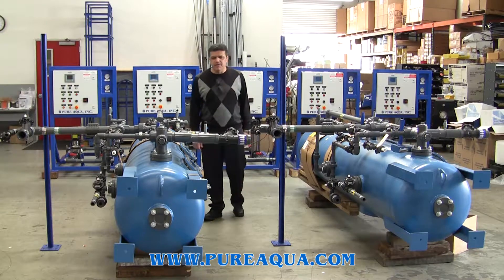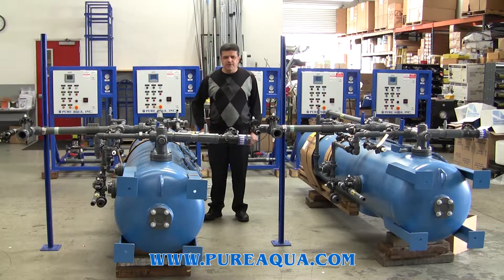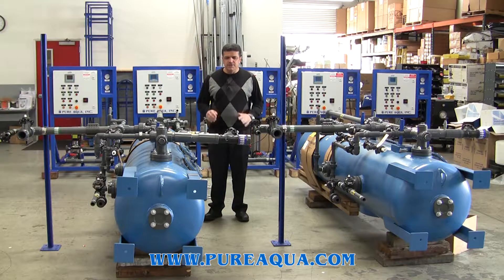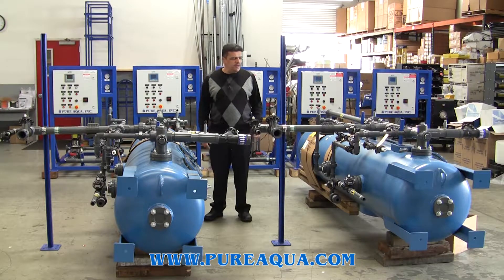The capacity of each of those trains is about 30 to 40 gallons per minute, and regeneration occurs after the quality of the water exceeds a certain resistivity. It's going to be a fully automatic regeneration system.